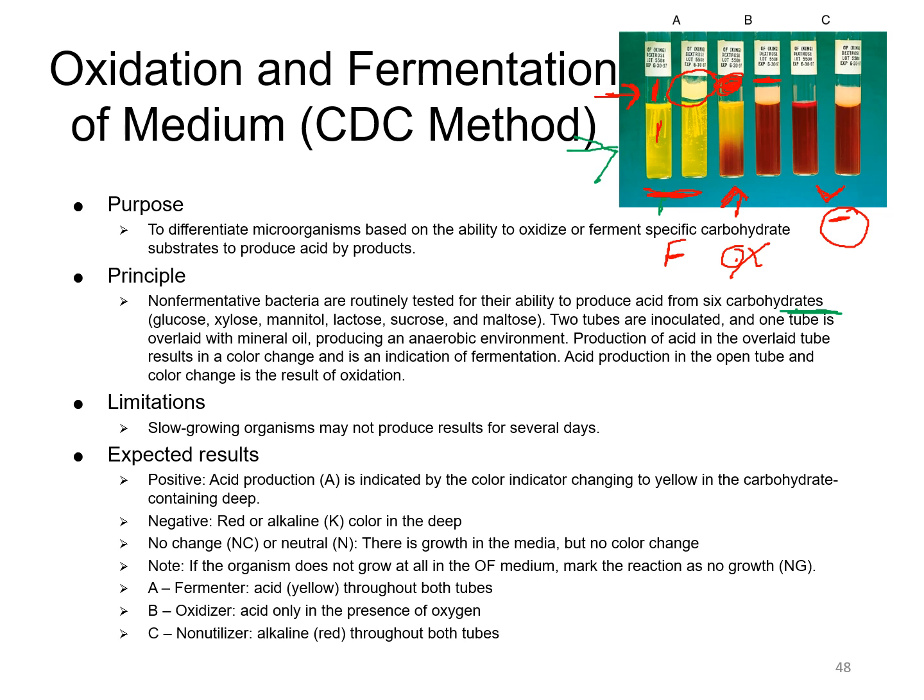And a lot of the modern methods today either use analyzers, or they will use a long strip test where the sugars are all actually within little wells within that strip, and you'll load the organism into each individual one. So if, for example, you're looking for glucose in one, lactose in one, then you're looking for the color change in each of those.